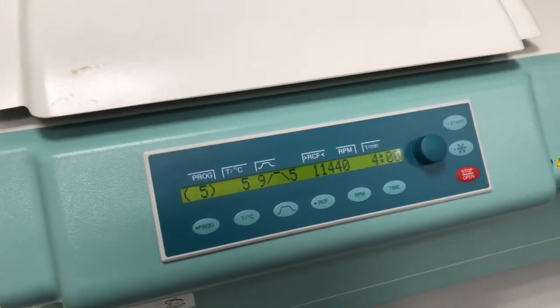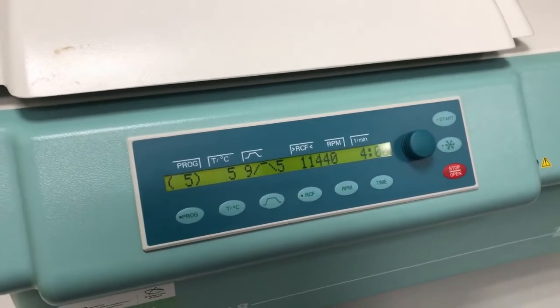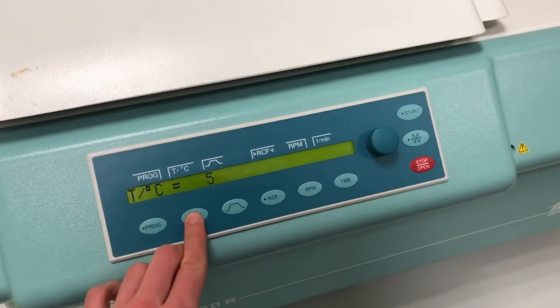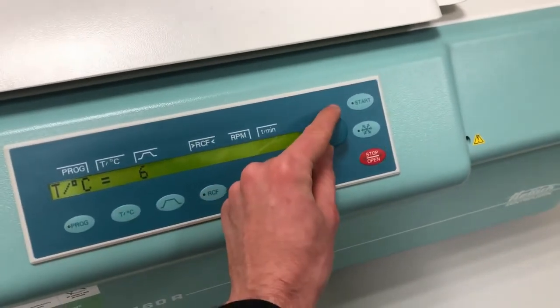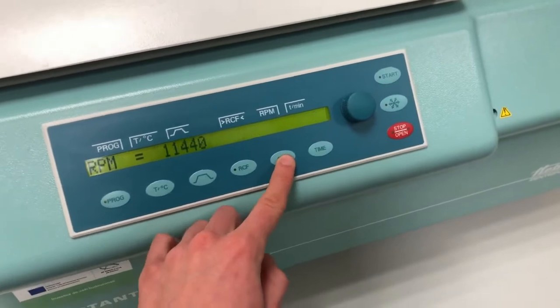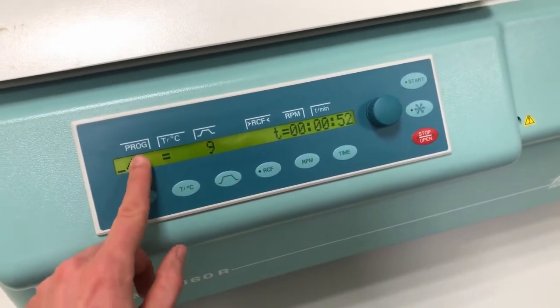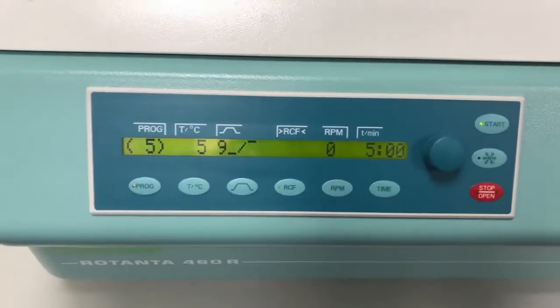And now you can see the menu. So as you can see, there are several important buttons and some not so important, like the program. Whoever uses this one. Now you can change the temperature, rotation, speed of acceleration, and most important, the start stop button.